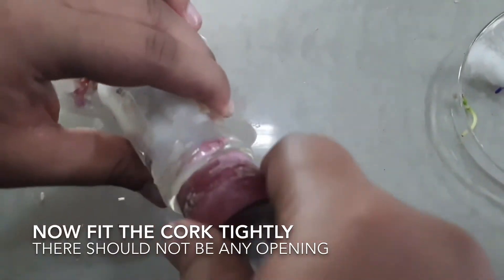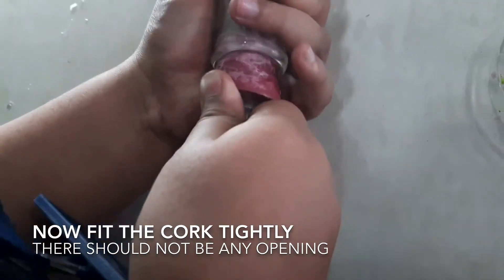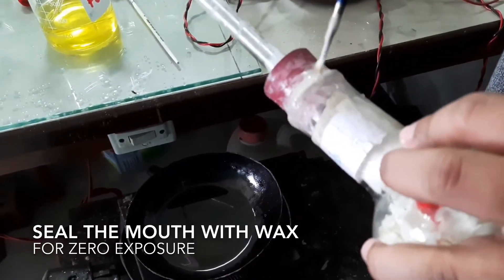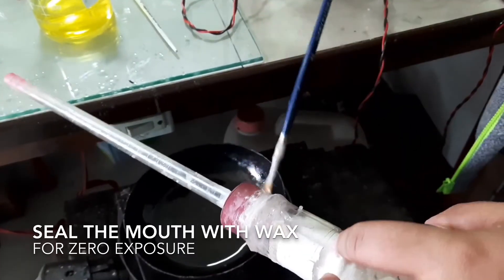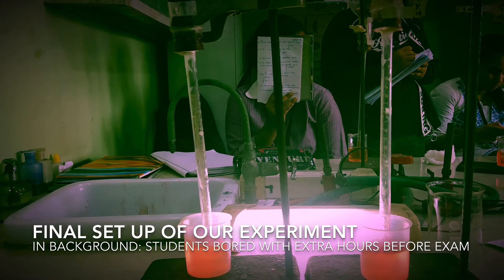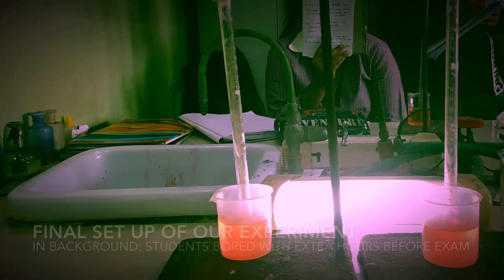A rubber cork fitted with a glass tube is introduced into the mouth of the flask in such a way that it becomes airtight. You can use Vaseline or seal it with wax for zero exposure. The whole setup is then inverted and the mouth of the glass tube is introduced into the brine water taken in a beaker, and the initial level of the brine water is marked.